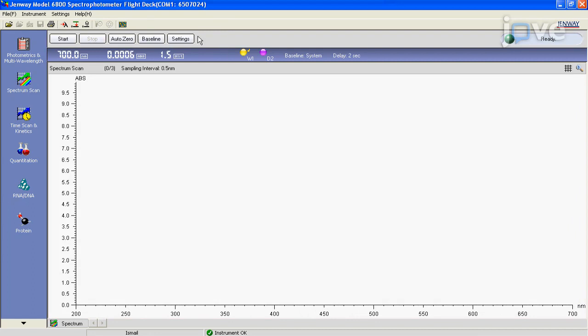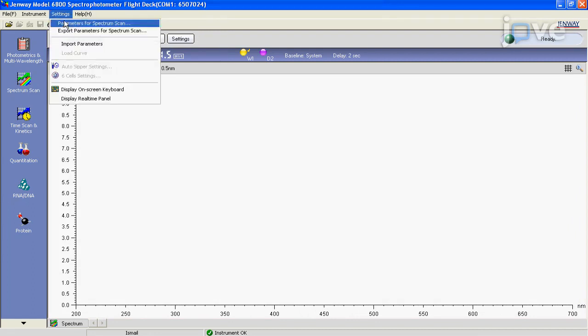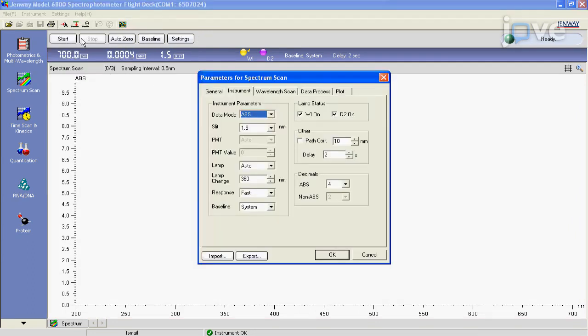In the software, click on instrument and go to settings in the command bar. Select parameters for spectrum scan, then adjust the settings for measurement.